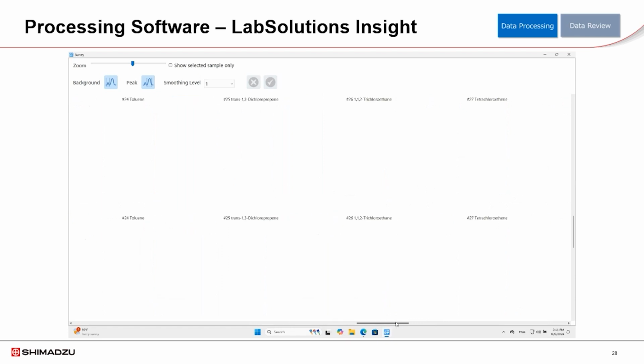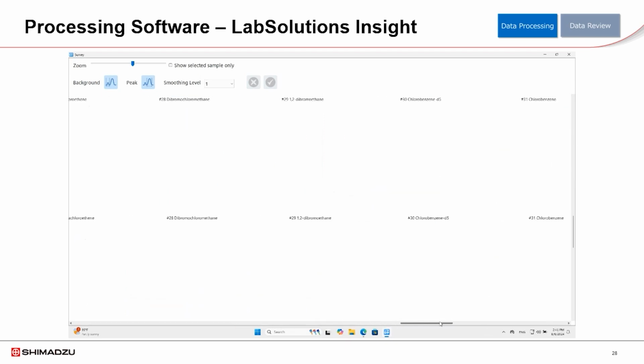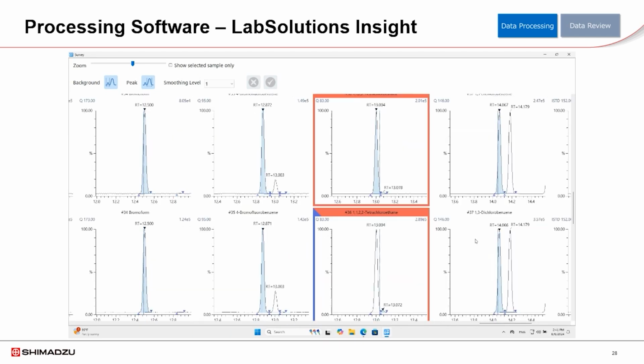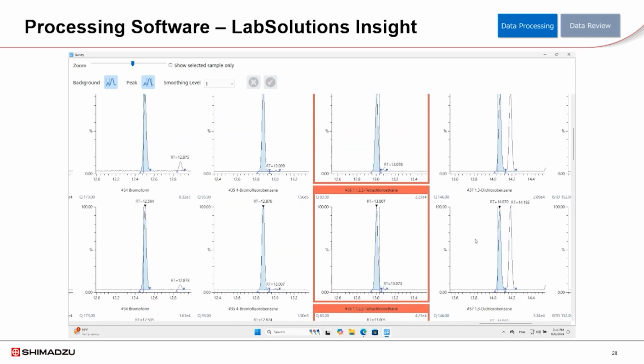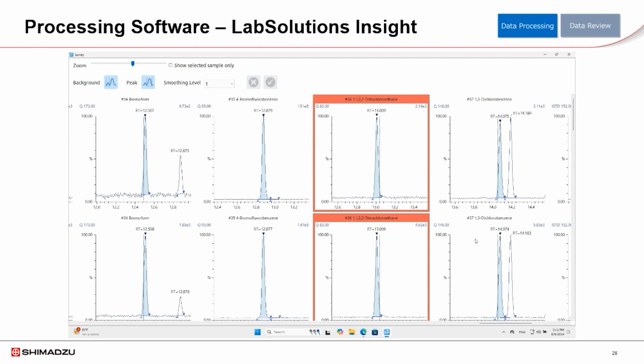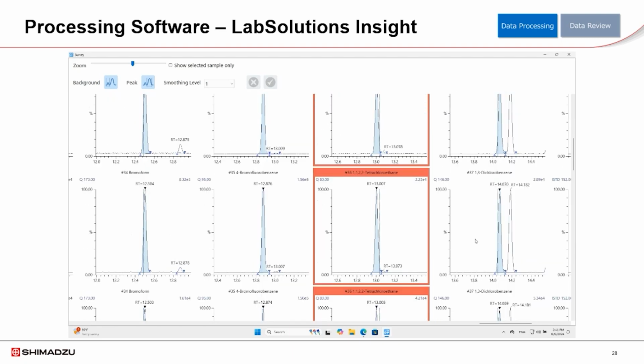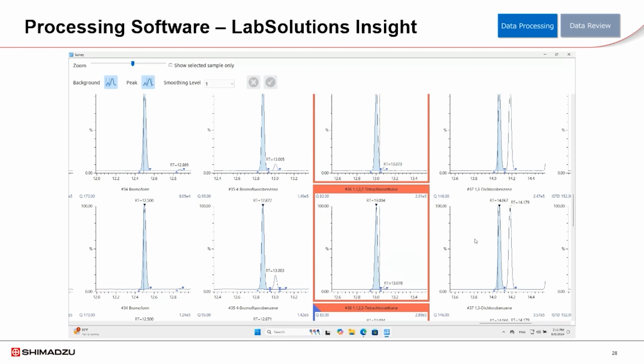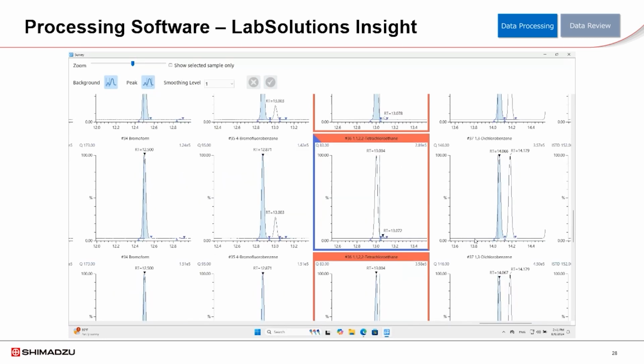The processing table is slightly shifted from the correct retention time. So we can update that compound's retention time and the ion ratio like this. Once we update from the current existing result, it shows the correct processing result for sure.